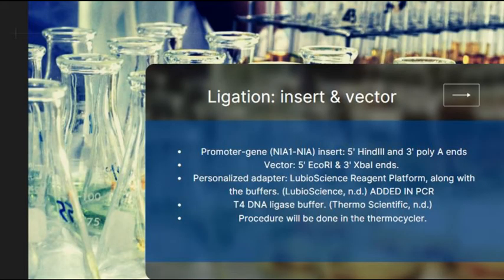The insert has 5' HindIII and poly A ends. The vector has 5' EcoRI and XbaI ends. Adapters added in the PCR were used for the correct ligation to happen. The ligation is done in the thermocycler with the T4 DNA ligase buffer.